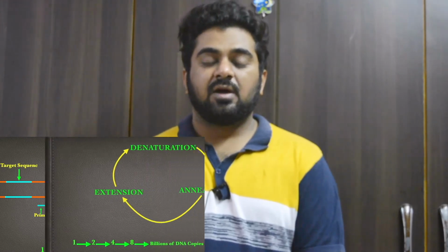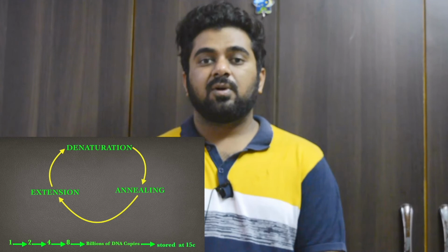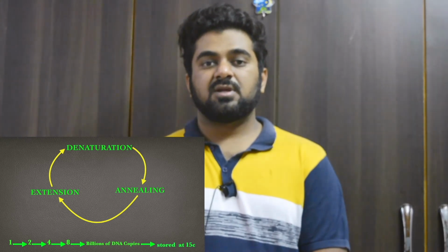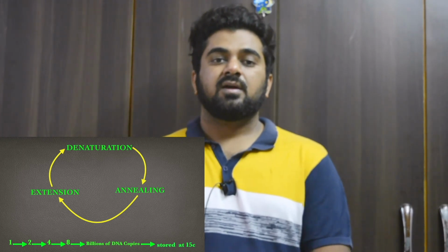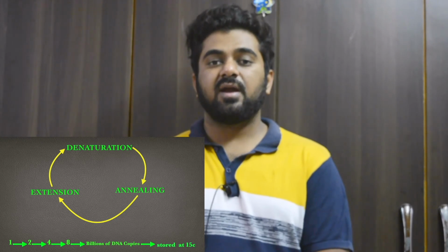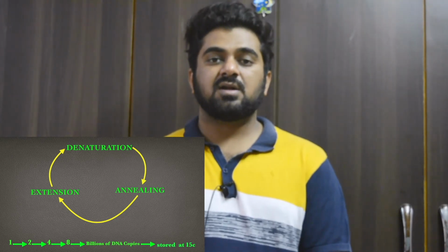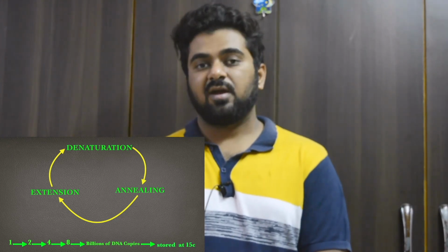Now this PCR cycle takes approximately 10 minutes. At the end of each cycle, there will be double the number of DNA, right? So if at the end of the first cycle there will be 2 DNA, then at the end of the second cycle there will be 4 DNA, then at the end of the third cycle there will be 8 DNA. So there will be an exponential rise in the DNA numbers. So after 5 to 6 hours we can create billions of DNA copies from one specific DNA.